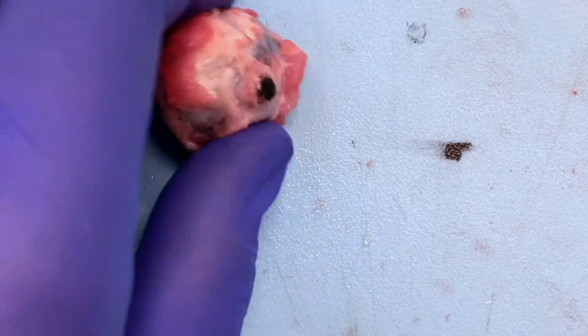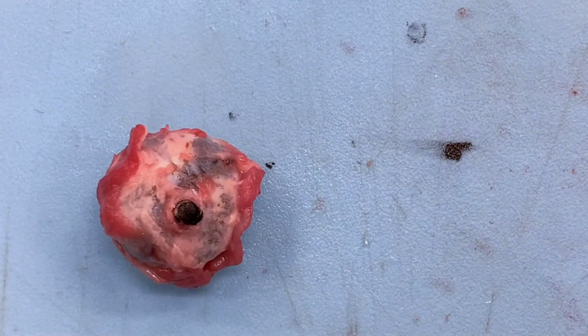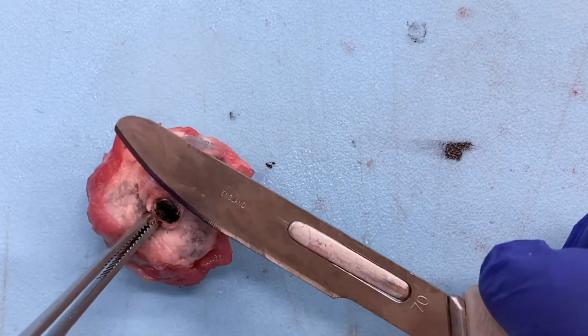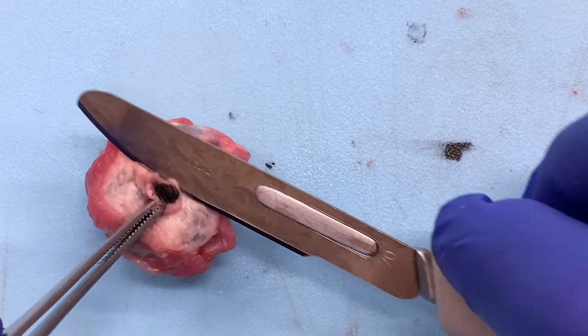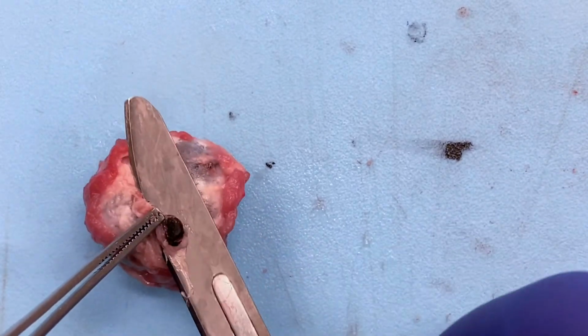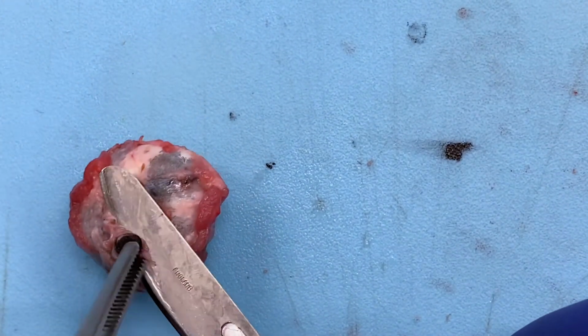So that's really the only thing you're going to be inking in these cases. Now, before you open the eye, the first thing you should do is shave off this optic nerve margin. Now, some of these eyes might have more of an optic nerve attached. I'm doing the one thing I don't like where I seesaw it. So let's just go ahead and cut.